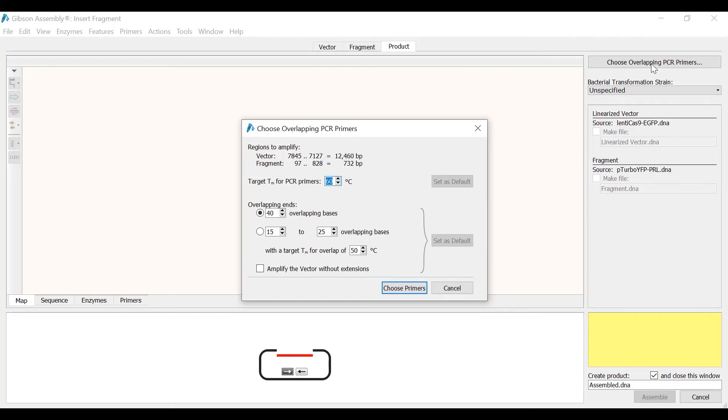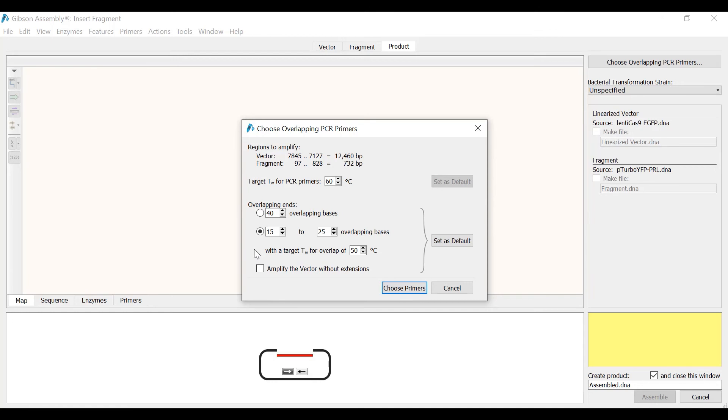The PCR primers will be designed to contain overlapping ends to permit Gibson assembly. Depending on your Gibson assembly protocol, you can select to have overlapping bases of a certain length, such as 40 bases, or you can specify a range of overlapping bases, such as 15 to 25 bases. Since I will be using the Gibson assembly cloning kit from New England Biolabs, I will select the latter option. This is because the manufacturer recommends using overlaps between 15 and 25 bases with a target melting temperature of approximately 50 degrees Celsius for the overlaps.